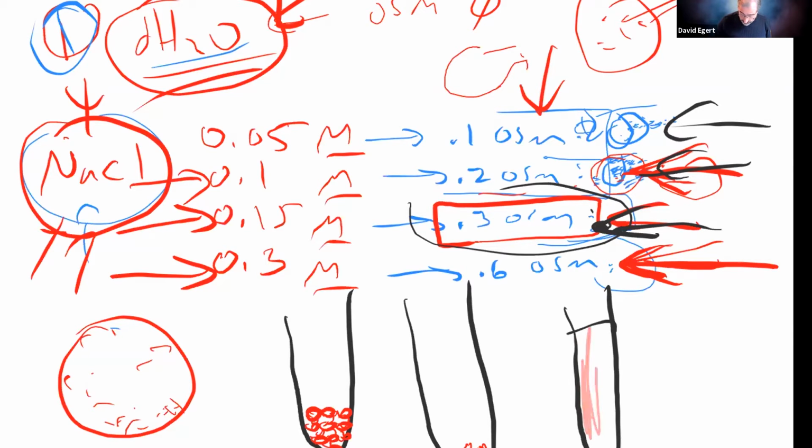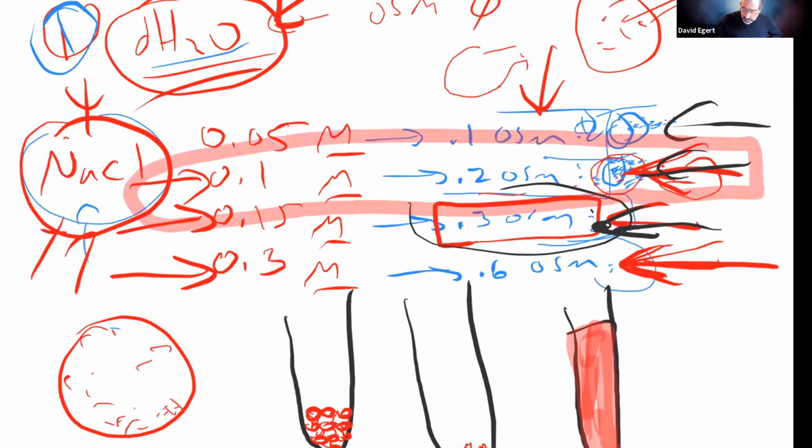A red supernatant. Would I have any kind of pellet at the bottom? No, not really. If they all exploded, then there are no cells on the bottom. What about here? What if I had partial hemolysis? I had some explode, but some of them actually didn't explode. They just got kind of fat.